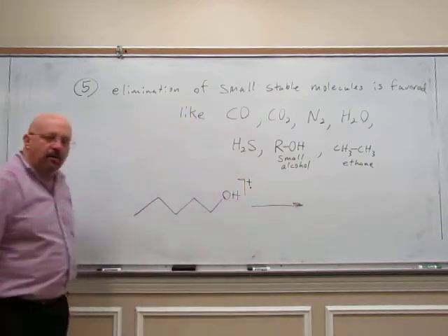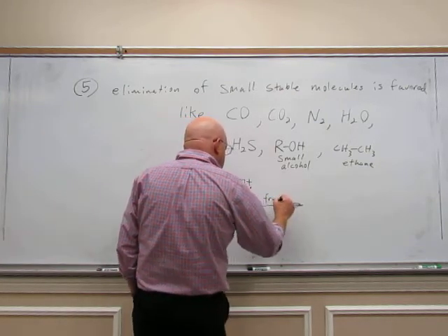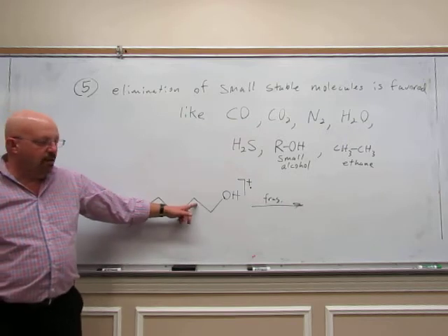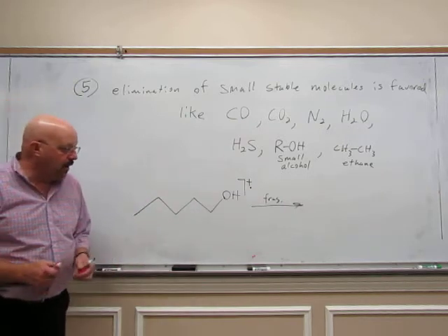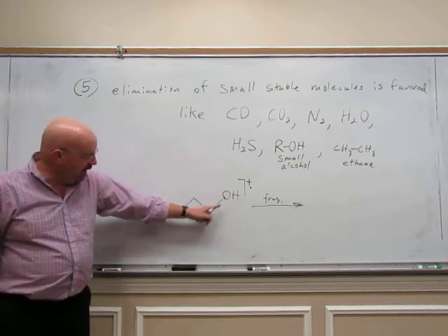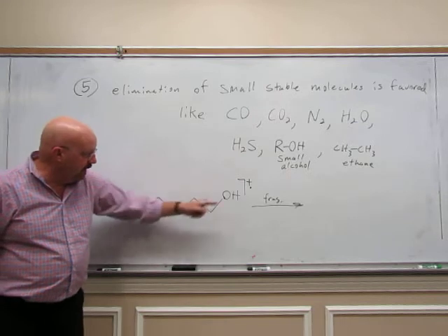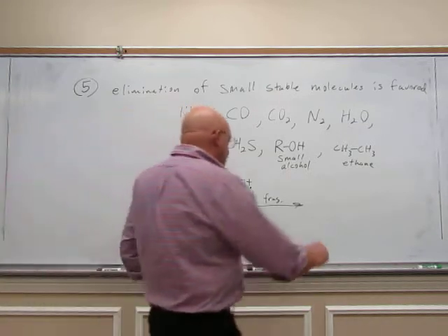That's our molecular ion or our parent ion. This will want to fragment. Now we already dealt with this earlier. So one place it can break is the carbon-carbon bond closest to the heteroatom. We just had that rule. There's our heteroatom. Here's our carbon-carbon bond next to the heteroatom. So one thing it can do is cleave right there. And it's going to do that.